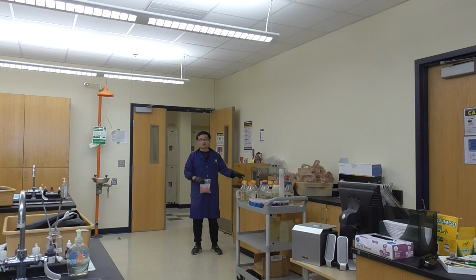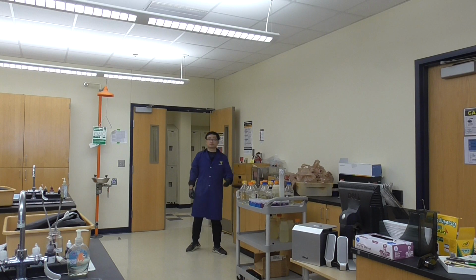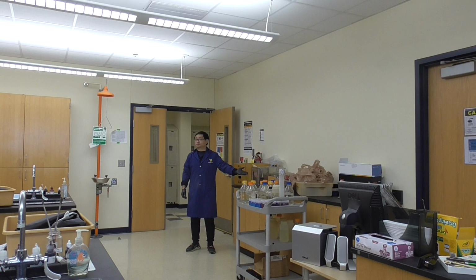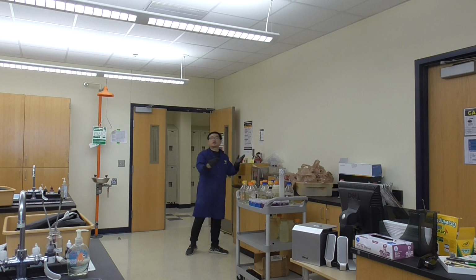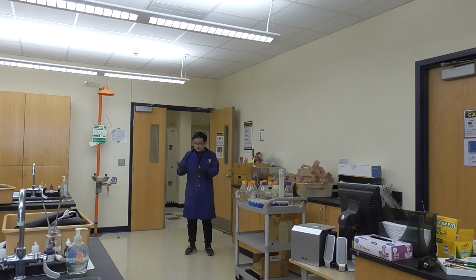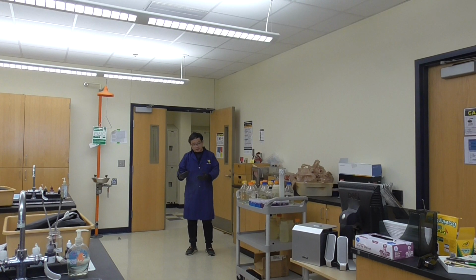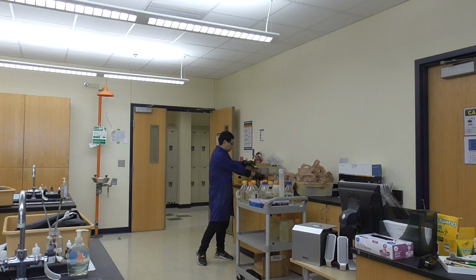That's a $2,500 homogenizer. That's what we use. How long? We can adjust the time here, about 30 seconds. You can homogenize, and the meat and the solution are mixed very well.